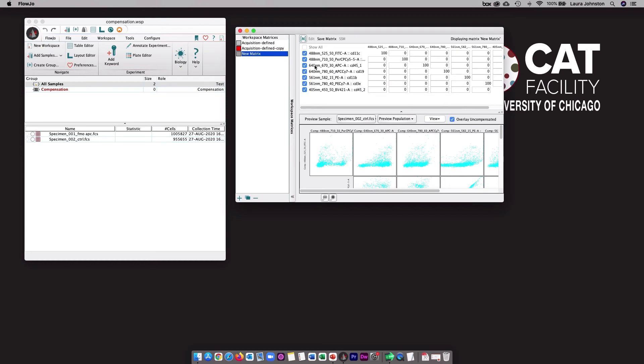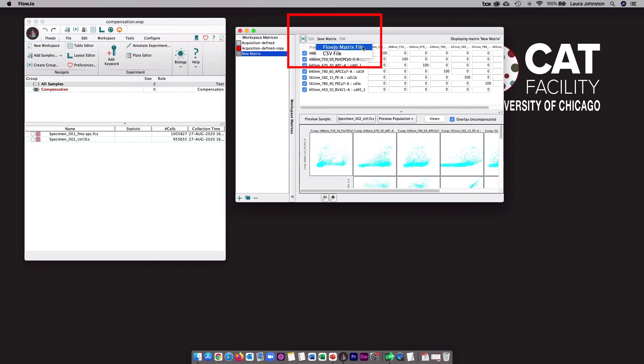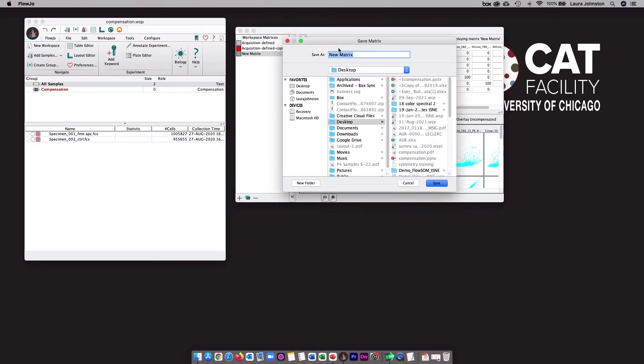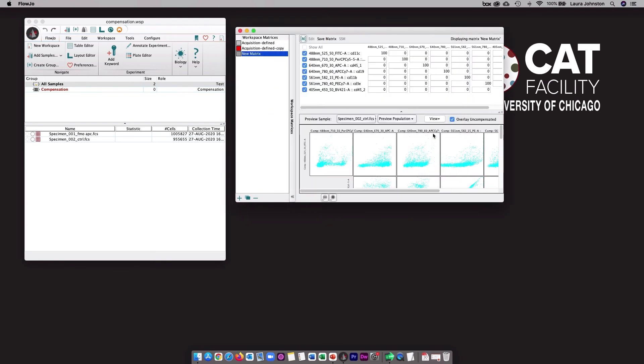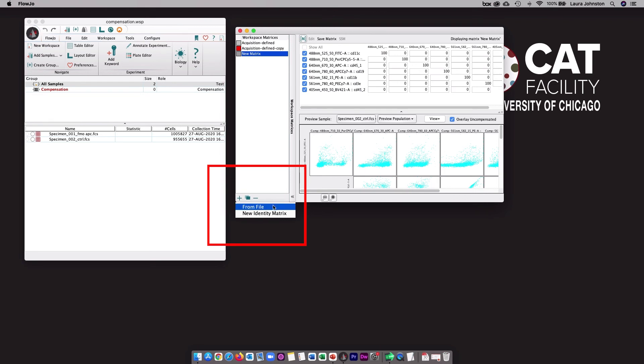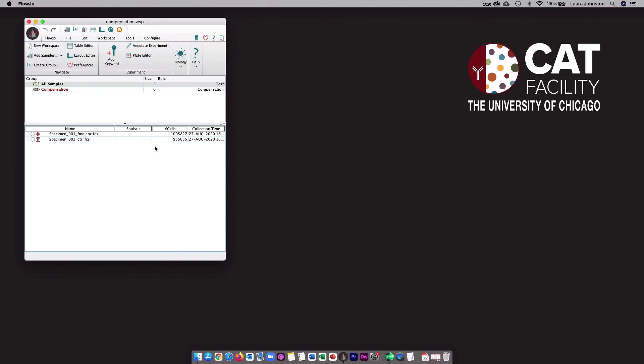Since I have this compensation window open, I'll first show you how to just export the compensation matrix. You will click on this save matrix button. I typically choose the FlowJo matrix file, and then you will tell FlowJo where you want to save your matrix. Once someone has this file, they can import it into any FlowJo workspace by going into this compensation window, clicking on this plus button, and selecting from file. You can then locate the matrix file, and it will be imported and listed here.